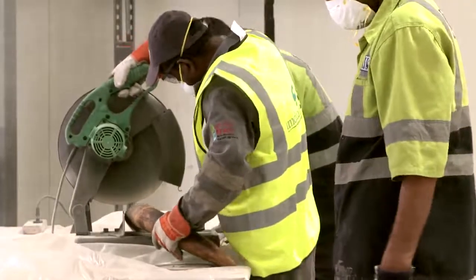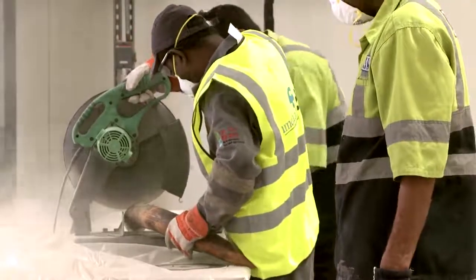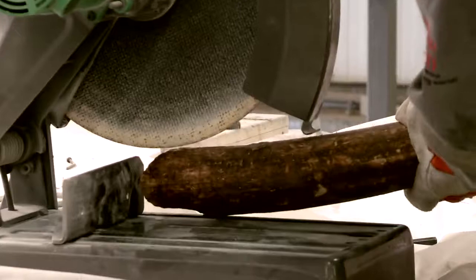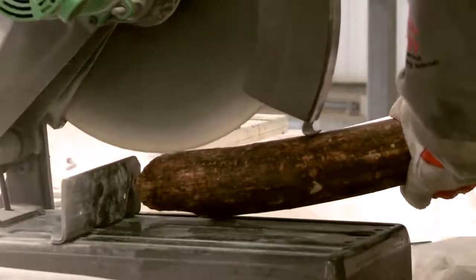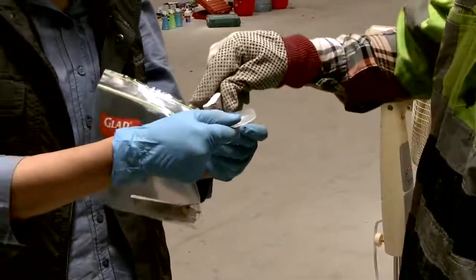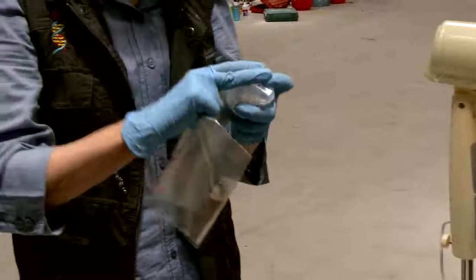The easiest and fastest way to cut the piece of ivory is to use an electric circular saw with a fine-tooth blade. Use this saw tool to cut along the square or squares you have drawn onto the tusk. Immediately place the cut sample in its corresponding labelled container and close.